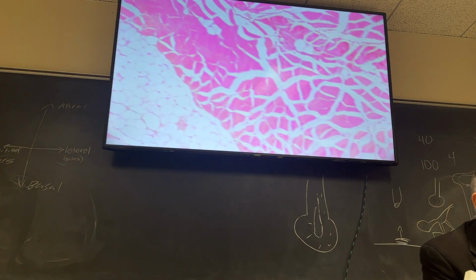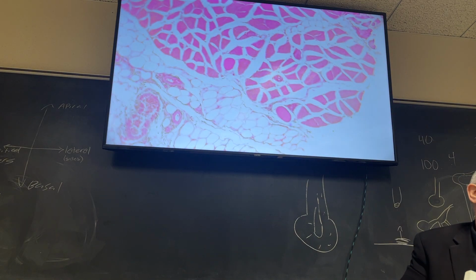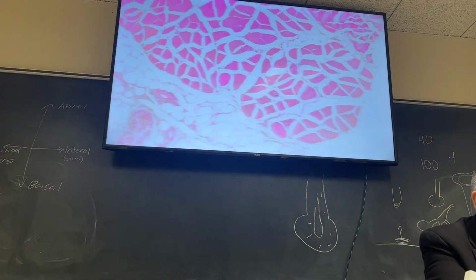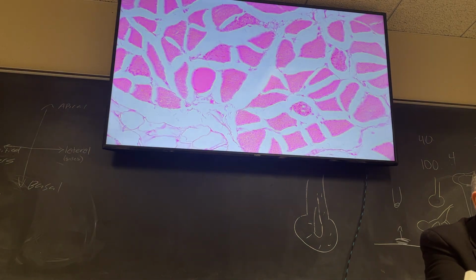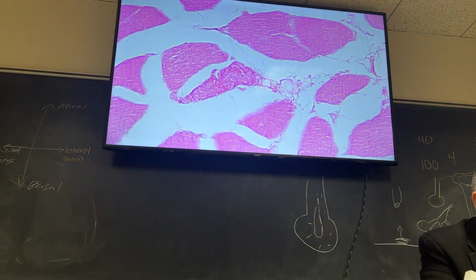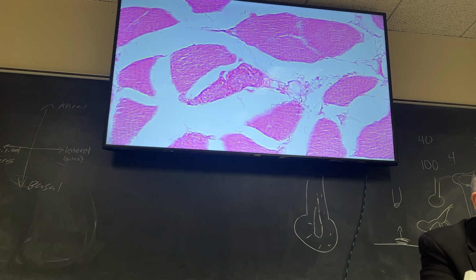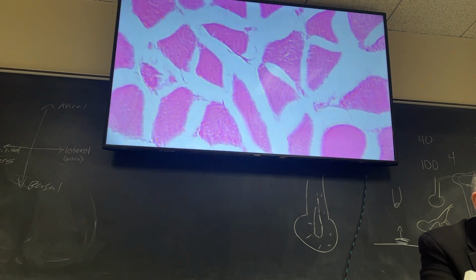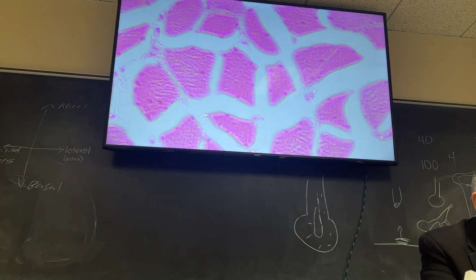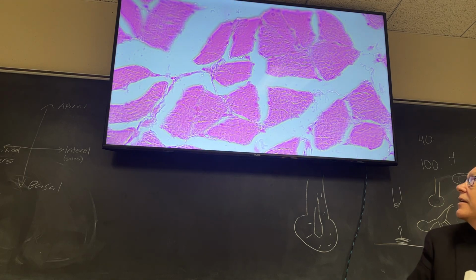If you go to a section where it's cross-cut, like this one, you can actually see it better, right? It's easier to see where the nuclei and mitochondria are on a cross-cut section because it's much more distinct, right? If you zoom in on a cross-cut tissue, that's not a true cross-cut, by the way. It's close, but not quite. This isn't bad, right here. This is okay.